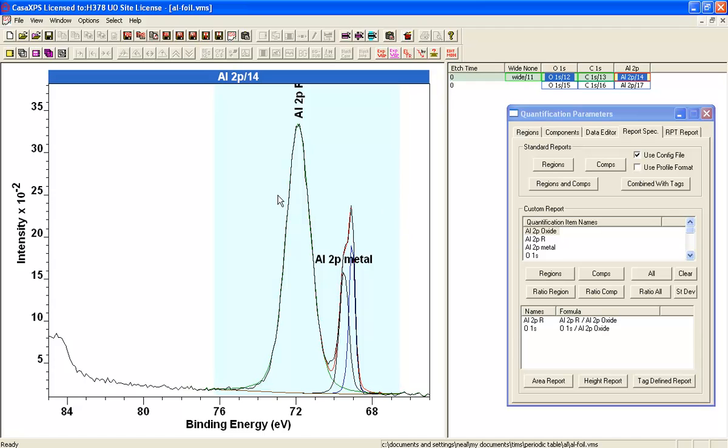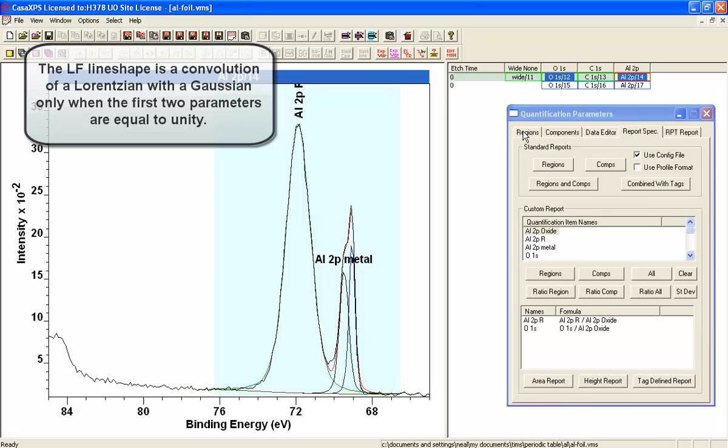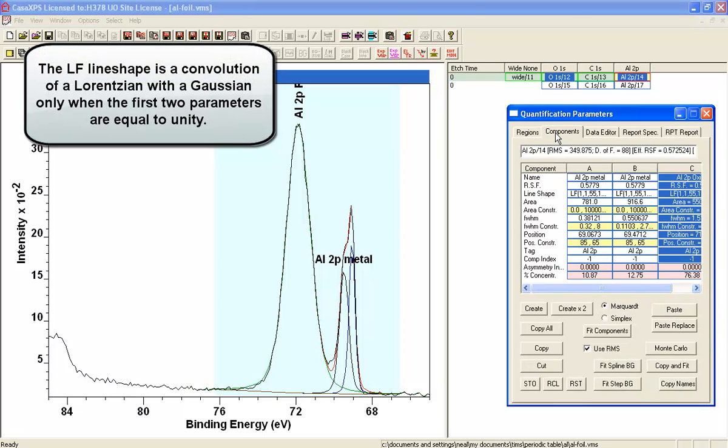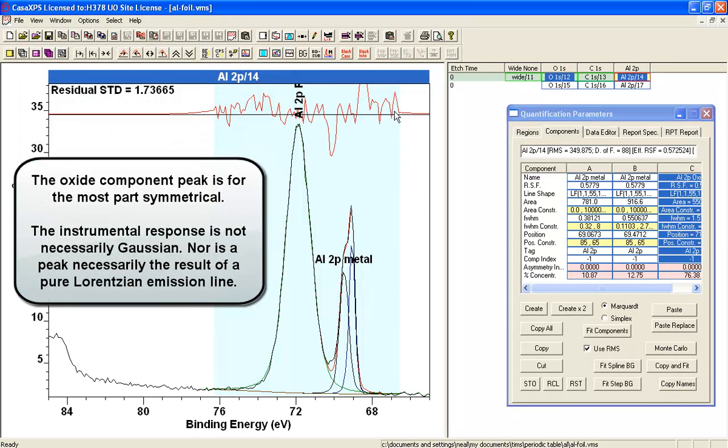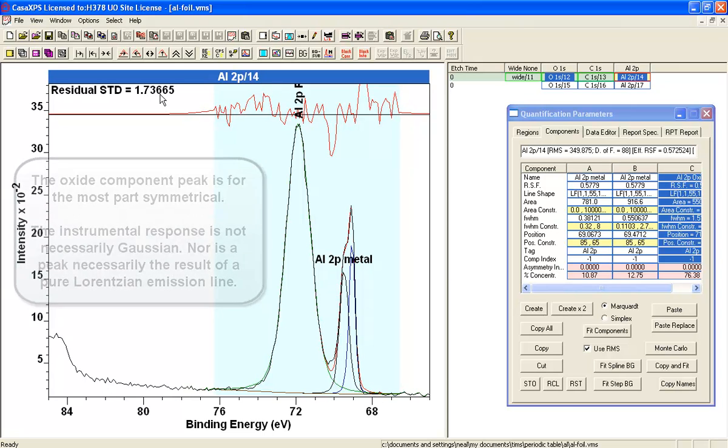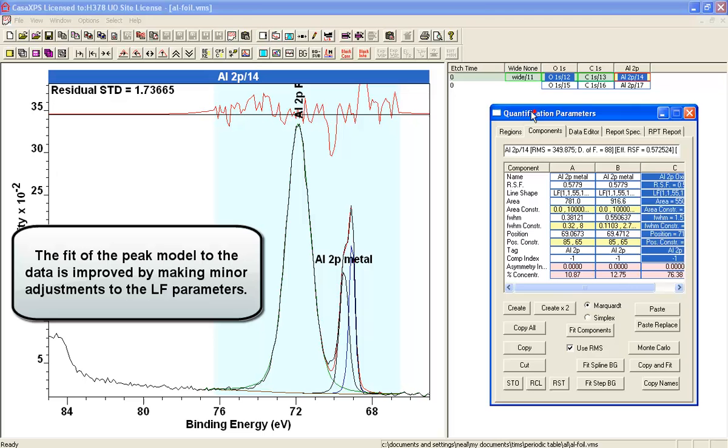So although this peak model looks reasonably good, what we have to do now is refine it to make sure that the signal that we're getting is appropriate. You see the fit can be estimated how good it is from the residual, and the residual standard deviation is 2.17. We'd expect it to be about unity, so we need to refine this a little bit.